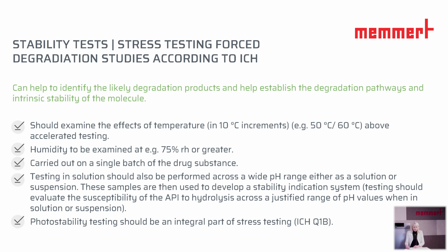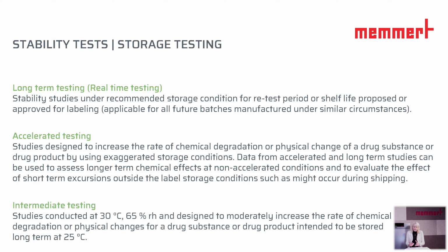That is the testing along with the light. Important here is always to get primary degradation and not completely degrade the API. When the objective of the stability study is stipulated and the method is certain, the drug will now be evaluated under a much larger scale, and now the stability study is performed. Here we are talking about the long-term studies, accelerated studies, and intermediate studies.